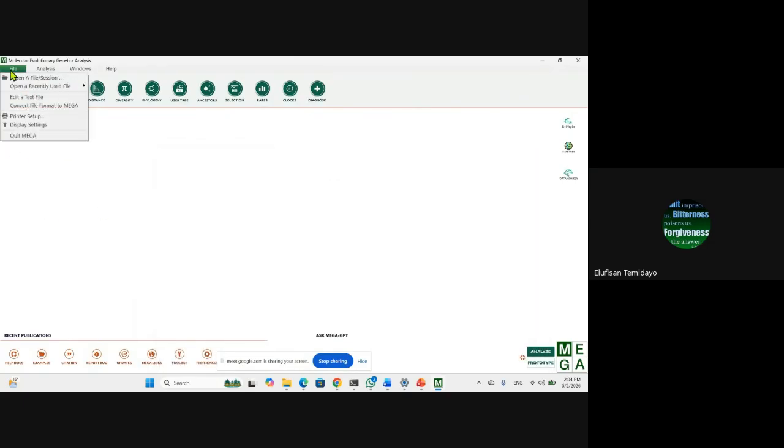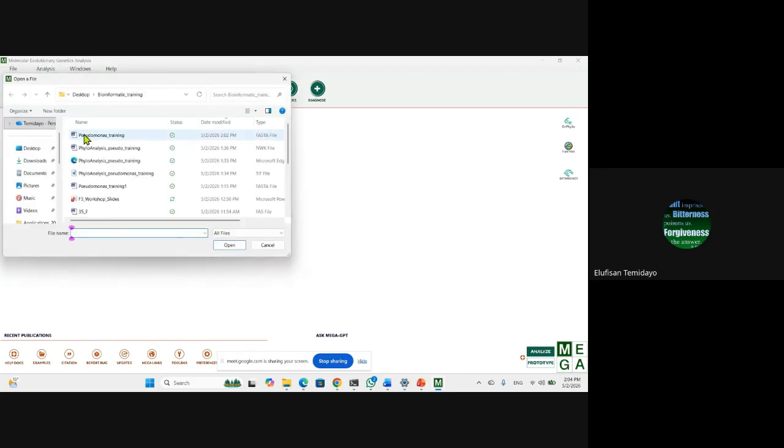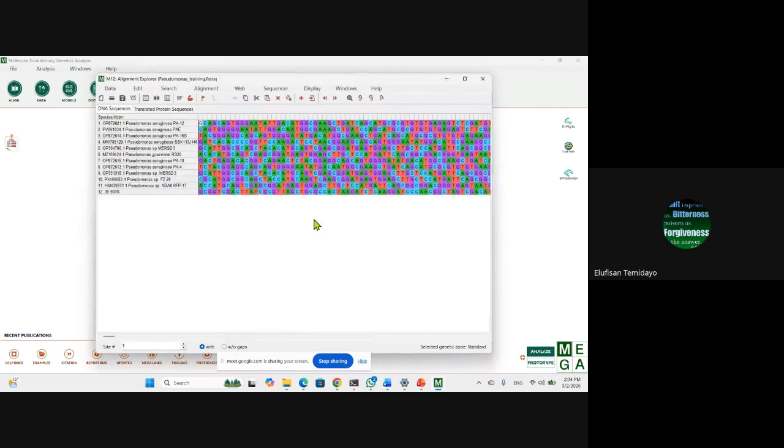Now, let's start again. Open a file session. This guy. Open. Align. Okay, now we have it. So this is what I said. Can you see that the names are shown? Okay, is somebody talking to me there? Yeah, I was listening. So can we see the names are shown now? Just because I put that hyphen. If it's not there, it's only going to give me the first lines. So let me close it and do it again.